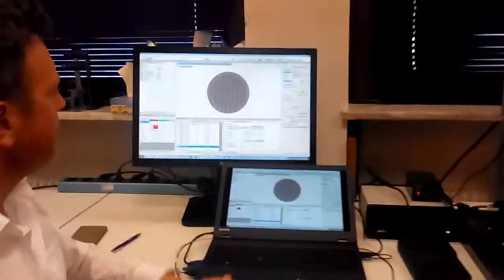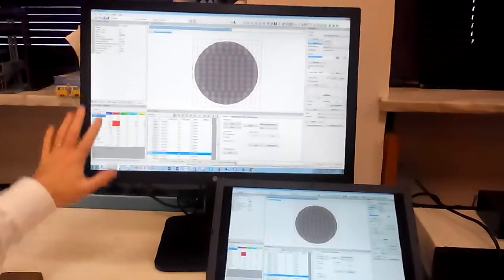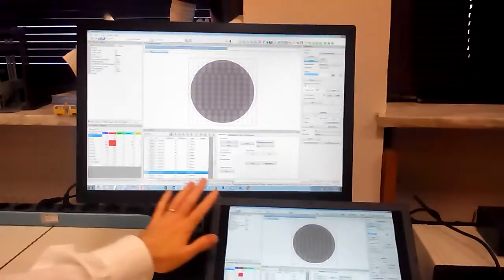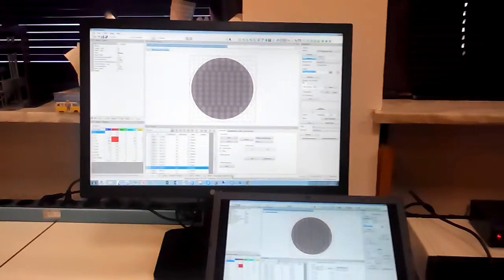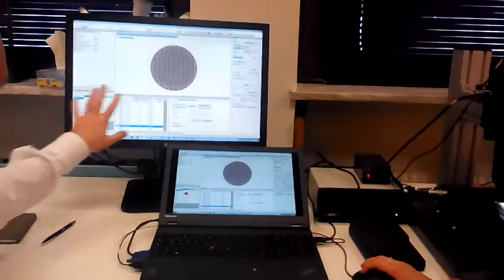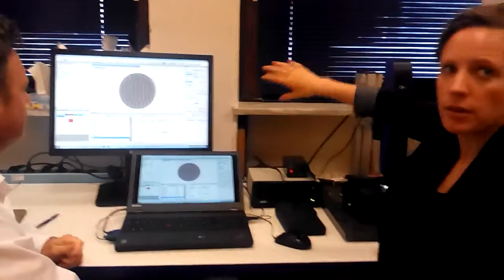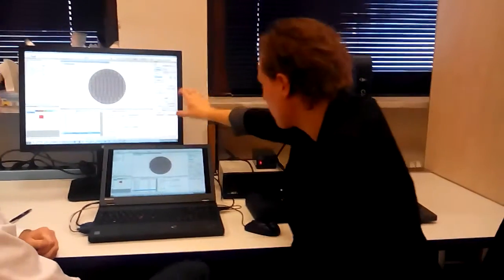So we move into this new phase, this new layout, which now starts to give us all of these different layouts, and I'm going to have to pass back over to Karen now to give us a summary of the windows of these different results, of what we've got. So on the right side here, you can see our control window. It stays in the same position.